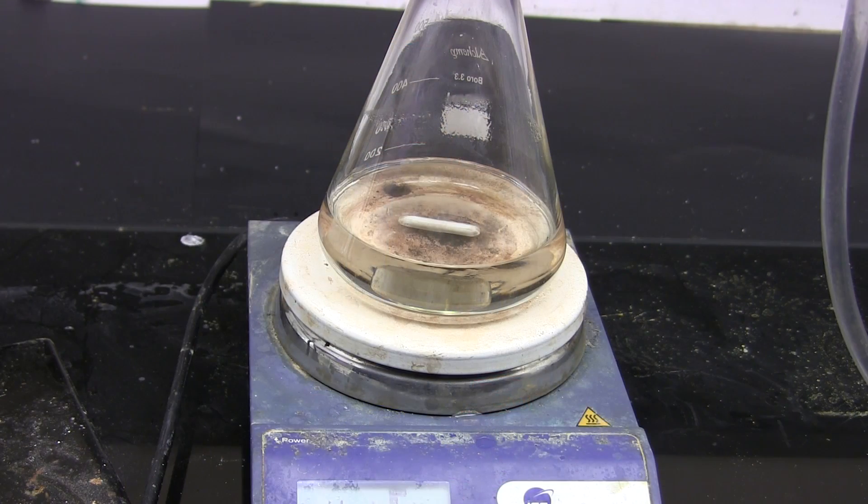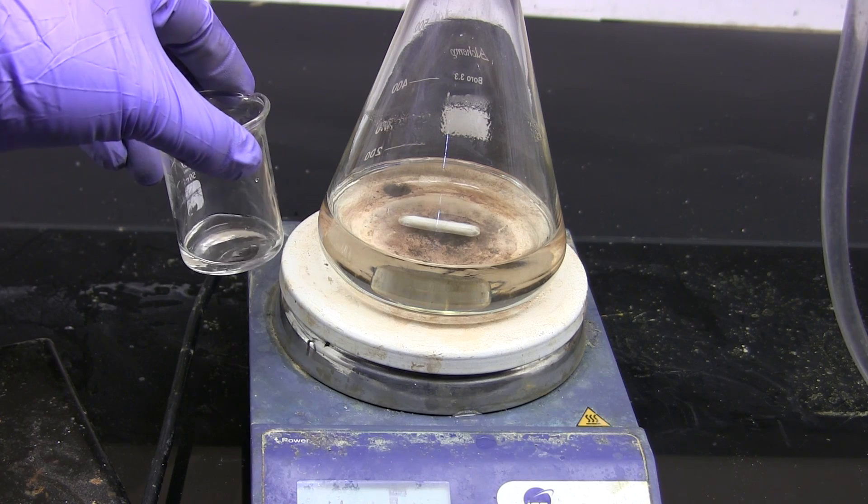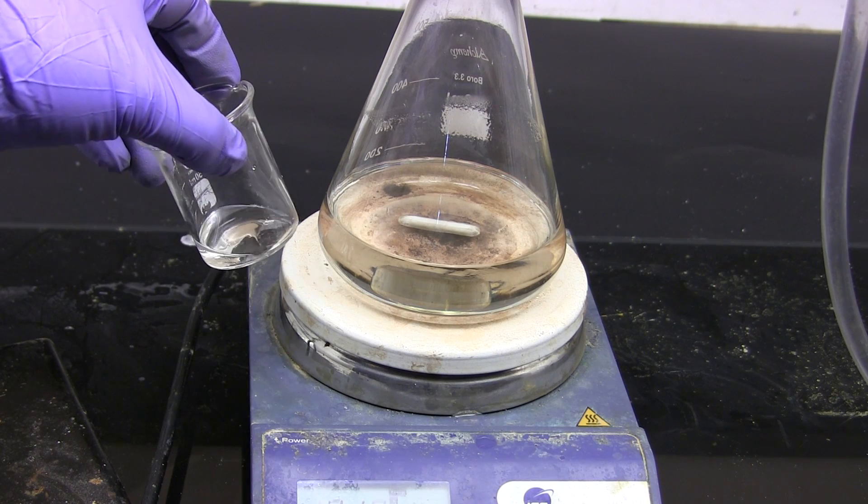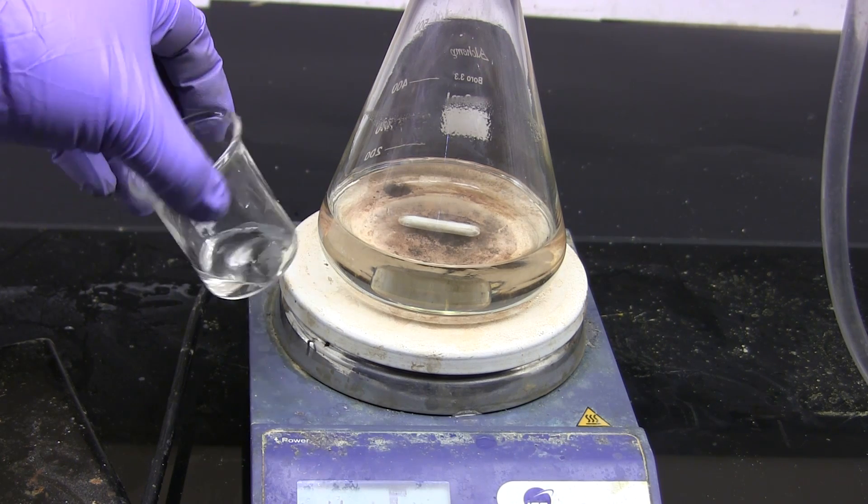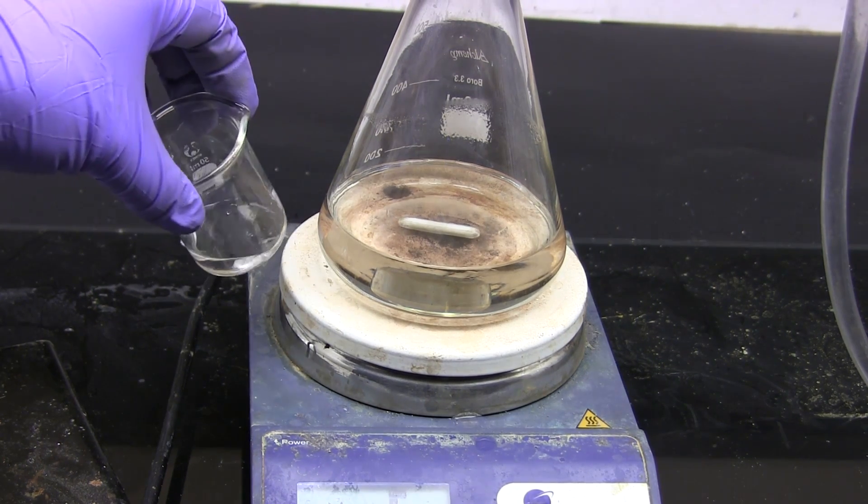And here is the toluene after cooling without any visible water content. And here is the water that was originally added. This method is a very cheap way of removing water from immiscible solvents and excellent for pre-drying solvents before using much more expensive chemical drying techniques. Allowing you to use less chemicals overall.